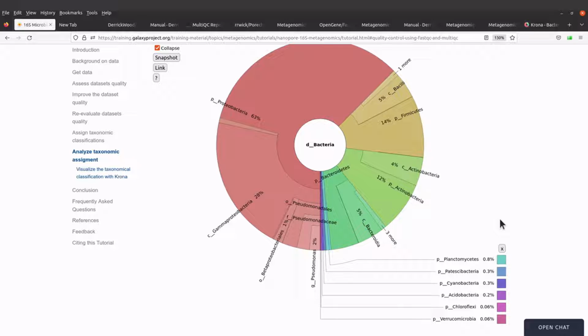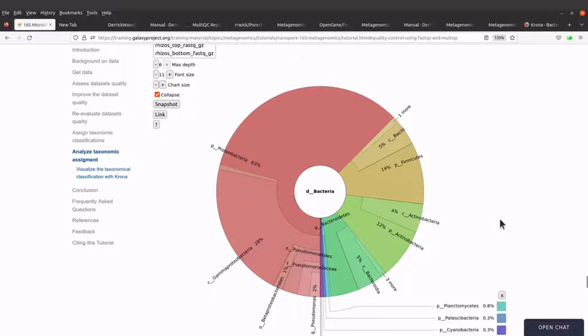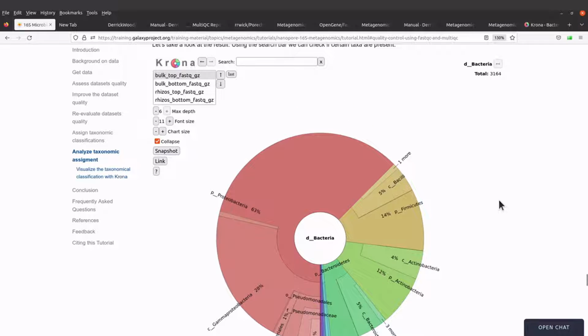And you also need to factor in what activities are being done in that environment, or what treatment has been given to the environment, or in this case, the soil. Once you get all these things in place, it becomes easier for you to interpret.